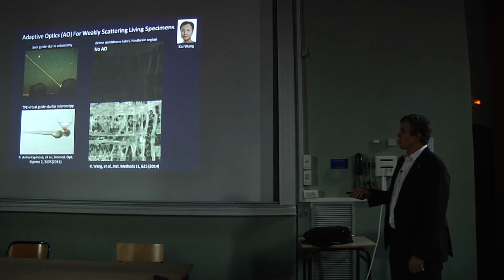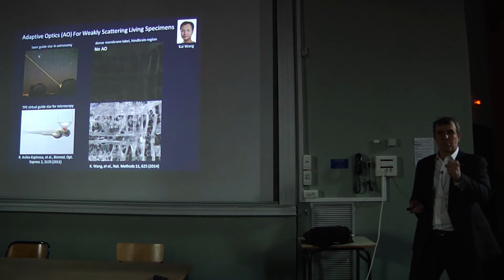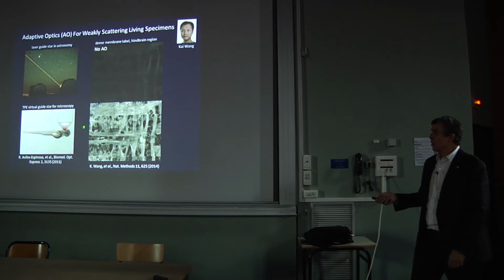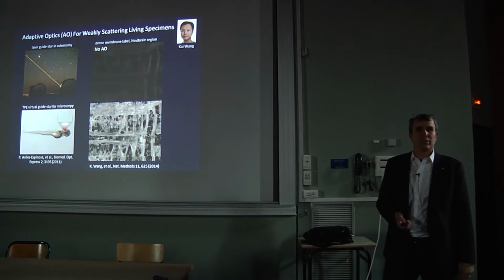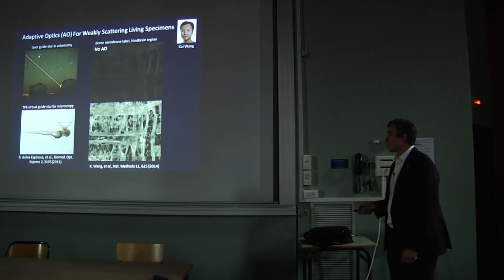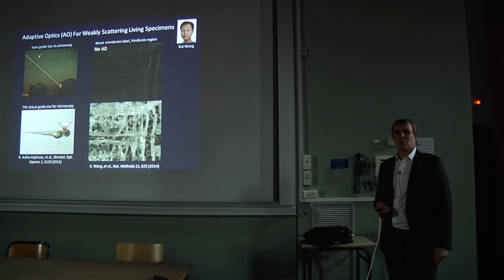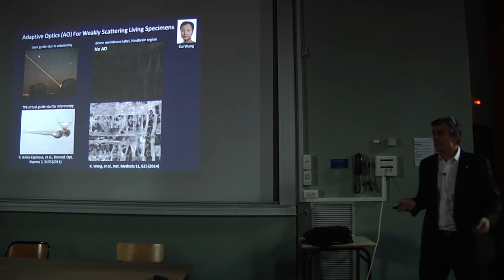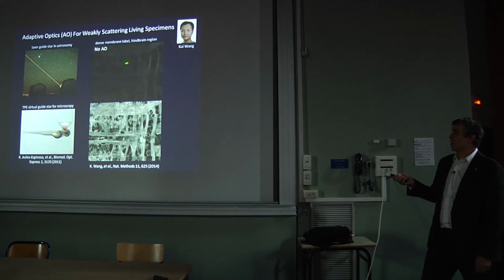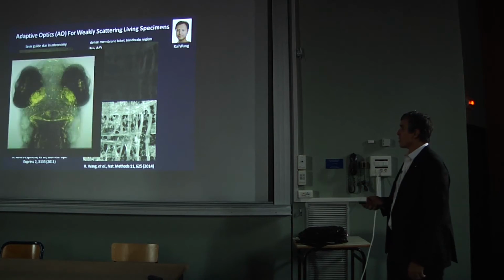A couple years ago, a group in Spain used a two-photon microscope, which creates just a spot of light instead of a cone of light, which they could then use to create a virtual guide star. We've adopted that principle and added some other things to make this more robust, and that works very well in transparent organisms to be able to recover diffraction-limited resolution. So here you're seeing a dense set of neurons, in this case first with the AO off, and you can see the low signal and then the recovery of the signal. And there's also a major recovery of resolution as you go through.